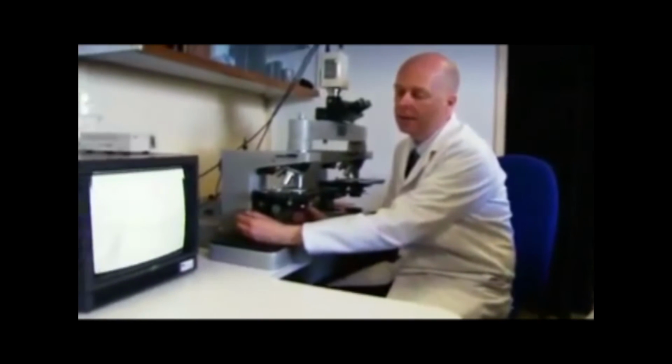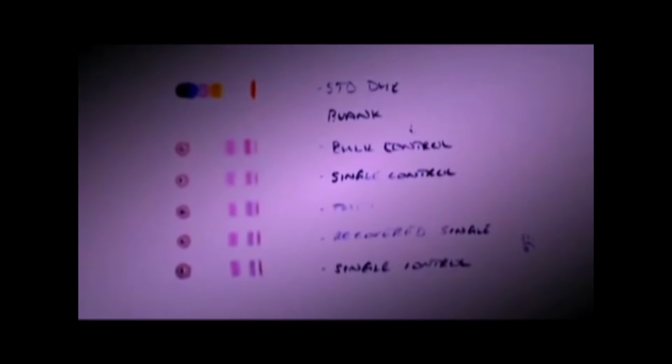Can Peter help me identify the fibres I collected? We got a garment that's made up of two different types of coloured fibre, but both acrylic. So it's certainly a start, isn't it? What we'd need to do now is to have the garment that we think the suspect may have been wearing, and then we can do a whole range of comparison tests. One of these tests can separate the individual colours in the fibre dyes. Forensic scientists can then compare these colour fingerprints to see if they match.